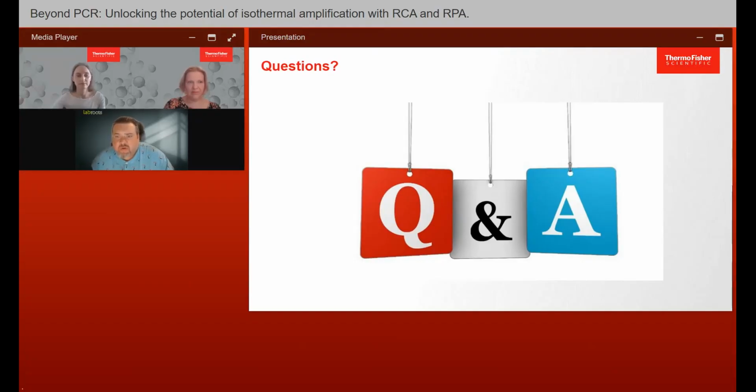All right, thank you. Next one for Rasa. Do you have the data on plant or seed pathogen detection assays using isothermal amplification techniques? Yes, we do. We have application notes using LAMP technique for plant pathogens, so we can find them in our webpage.